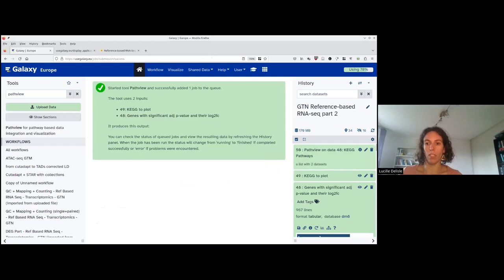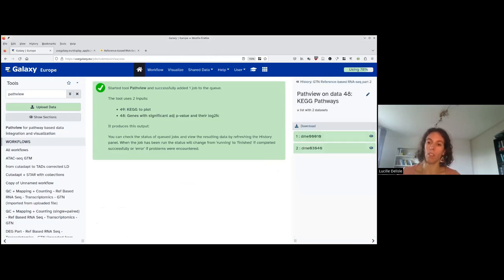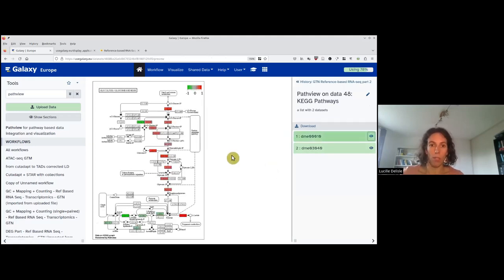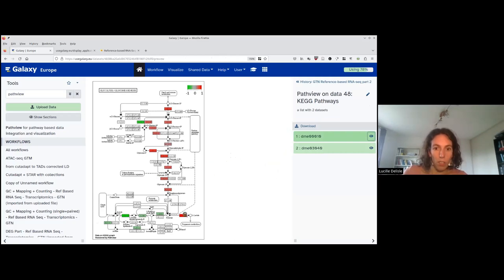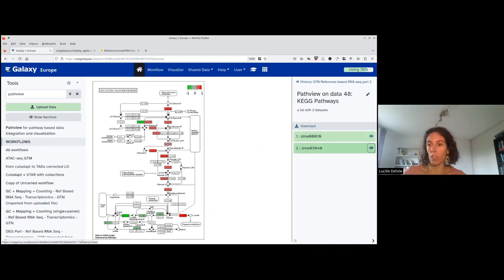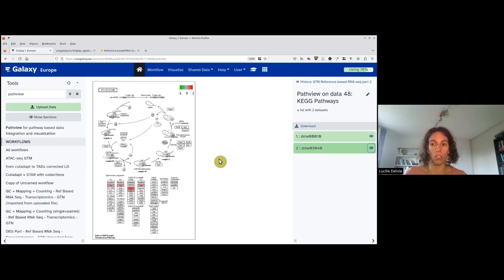PathView has finished. This is a list with two datasets corresponding to the two pathways. Checking the first pathway, which was overrepresented, we can see quite a lot of red (genes that are overexpressed) and some green (genes that are underexpressed) — the color code can be a bit counterintuitive. Checking the second pathway that was underrepresented, we see much fewer colors — just two genes that have been colored.